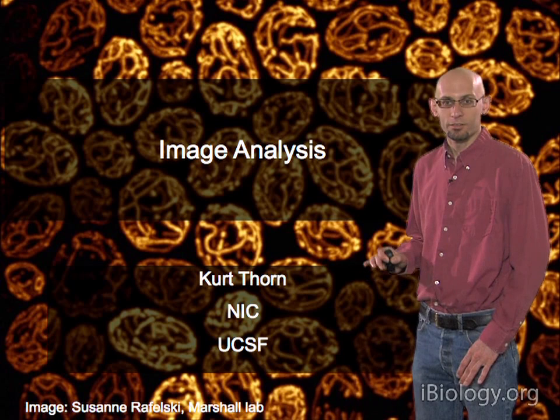You can equally well rotate each of these filters 90 degrees and get a set of vertical edge detection filters. If you apply a horizontal filter to the image, a vertical filter to the image, and then add those two images together, you get a detection of all edges regardless of orientation in the image. This can be very handy for finding boundaries of things, any type of sharp edge that you want to bring out in your image.